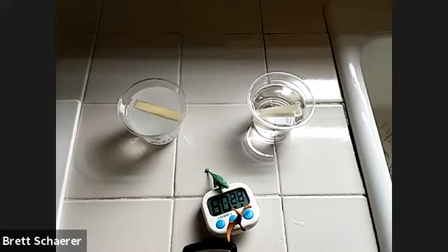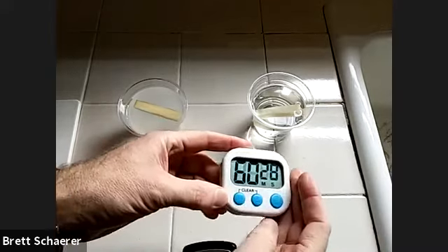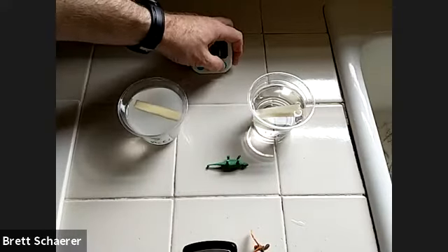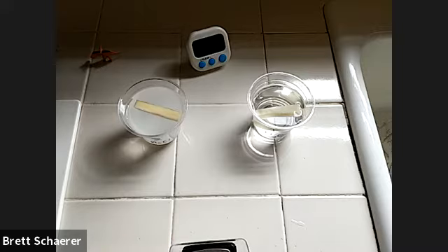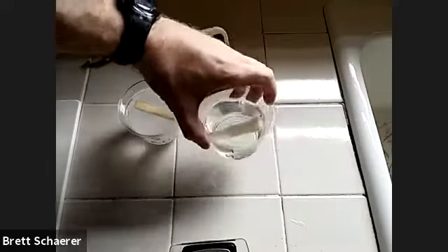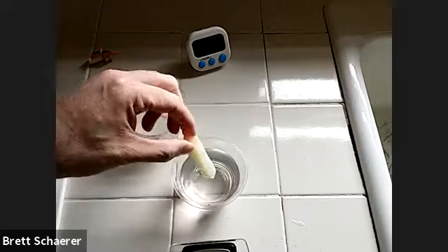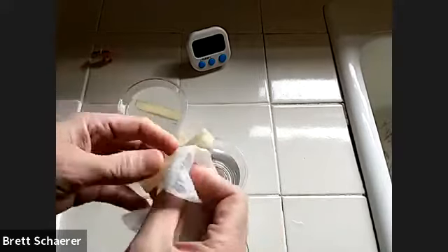Okay, looks like time's up. The lab assistants are telling me that it has been an hour. So I'm going to stop the timer. And we will take the potato pieces out of their solutions and weigh them. We'll start with number 1 in the water. And I'm going to actually blot this off before I weigh it.